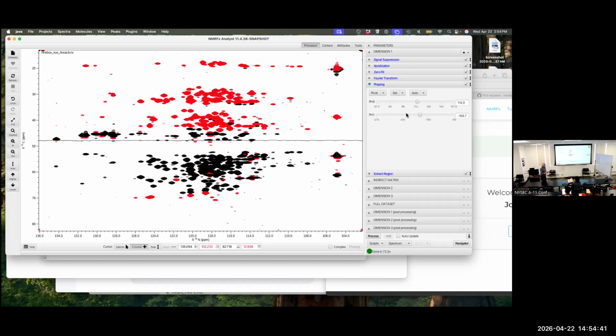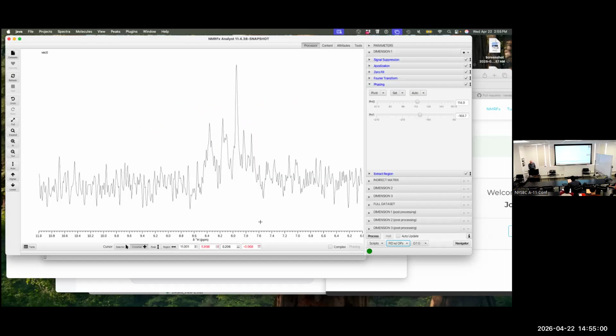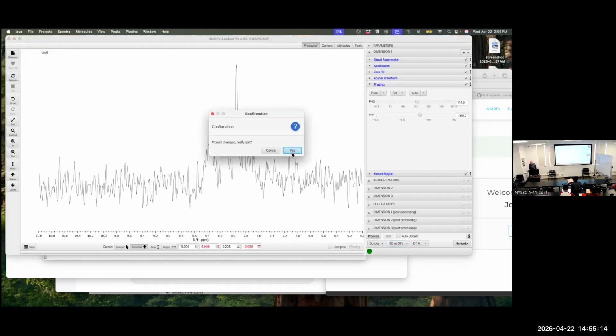If you set the experiment to that, then boom, you can set those up. Ideally, you'll set up the experiment so you don't have first order phase correction of 33 degrees and have to figure out what that is. First order in the first dimension is easy to fix. But in the indirect dimensions with the NUS, it helps if you are set to zero phase.